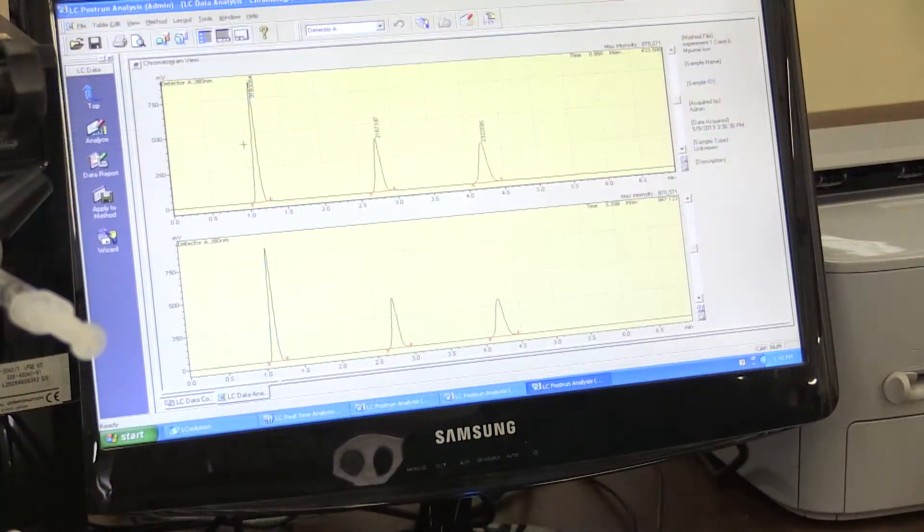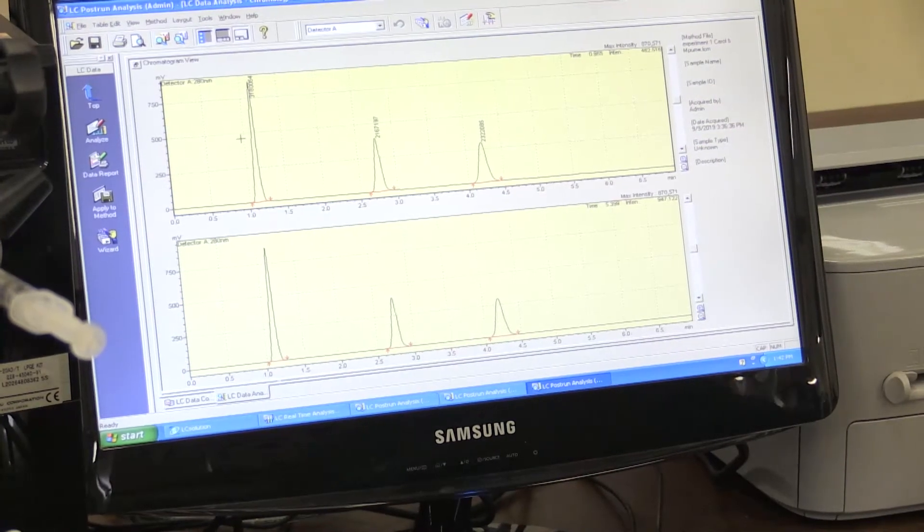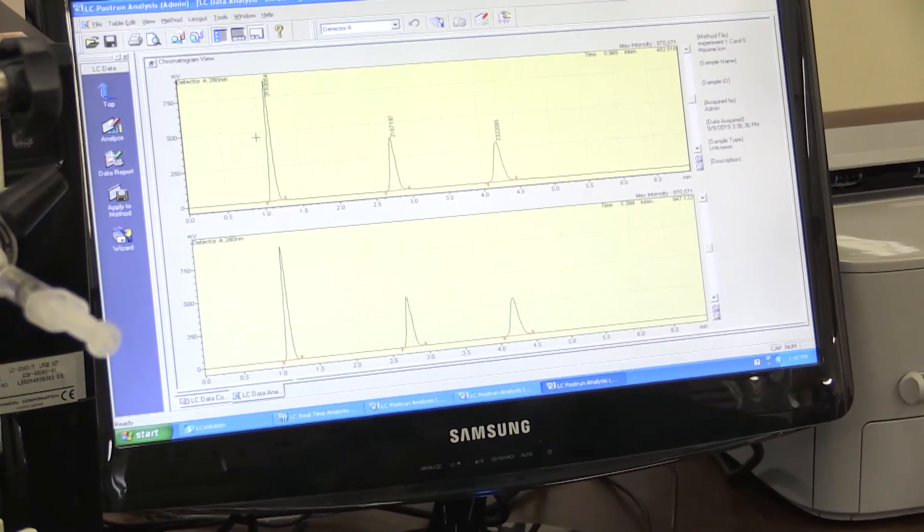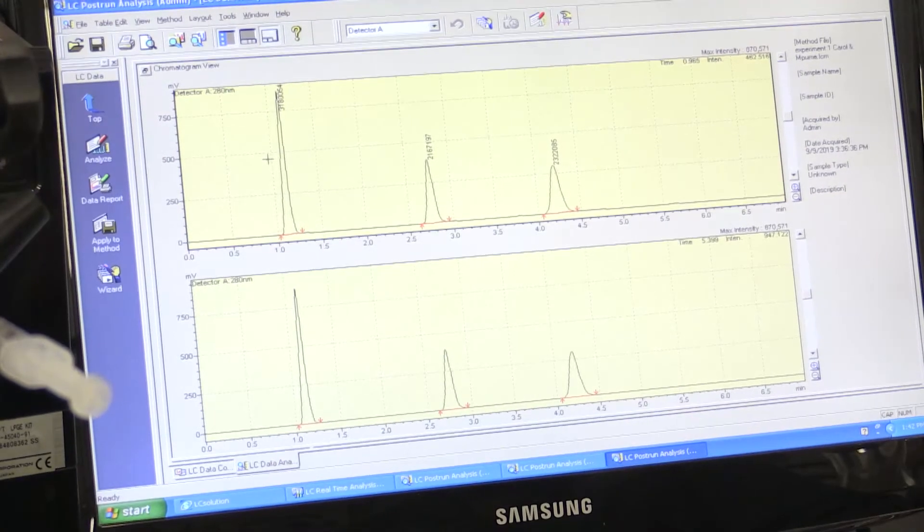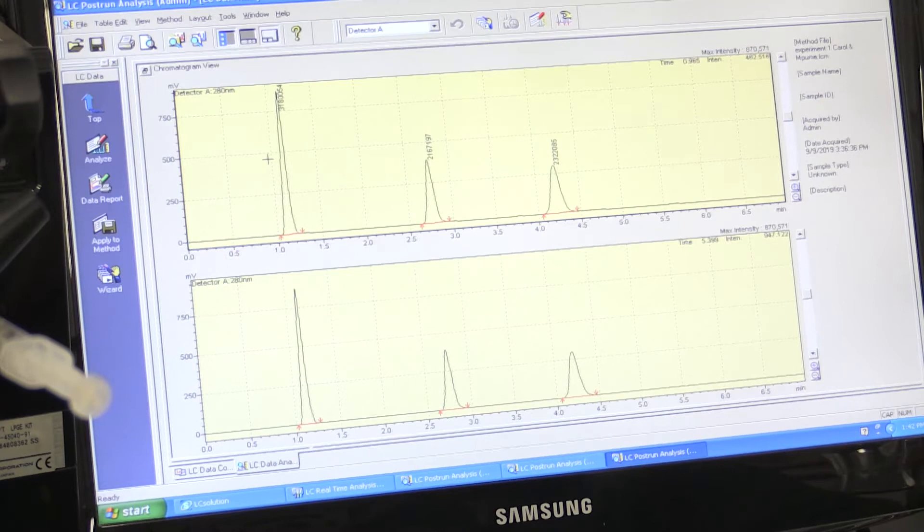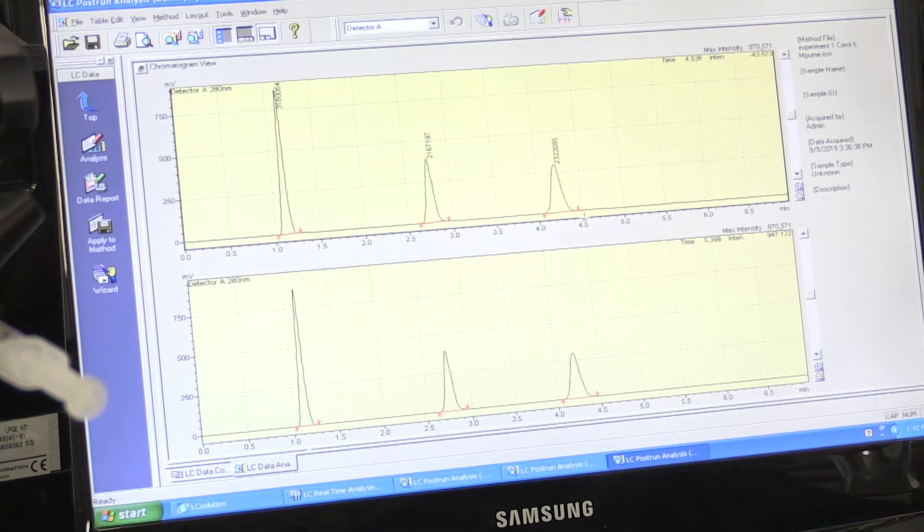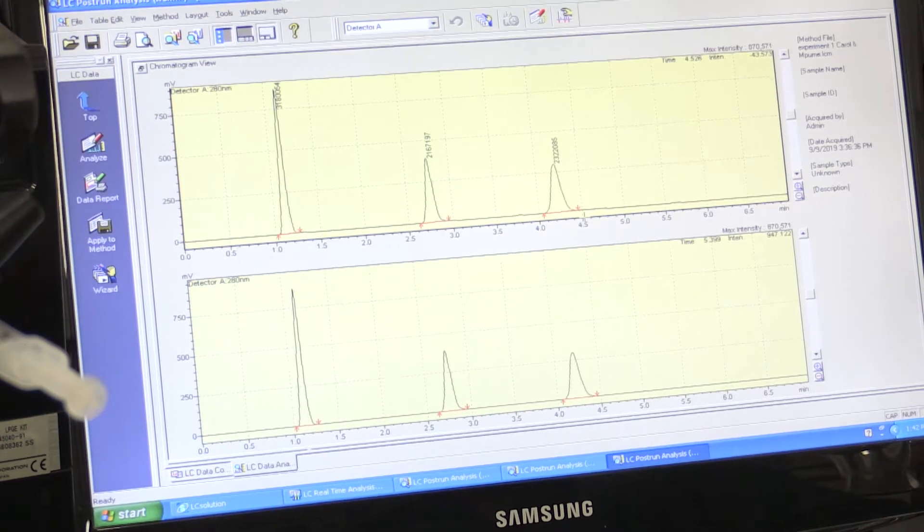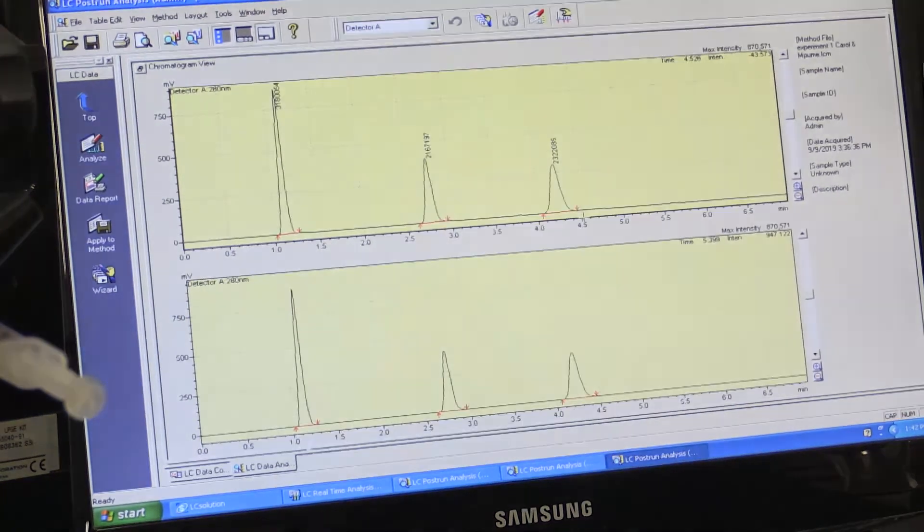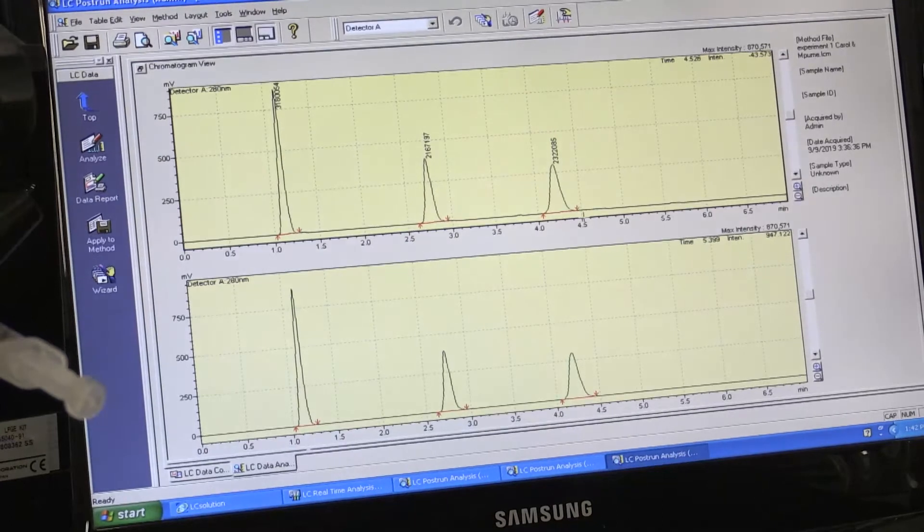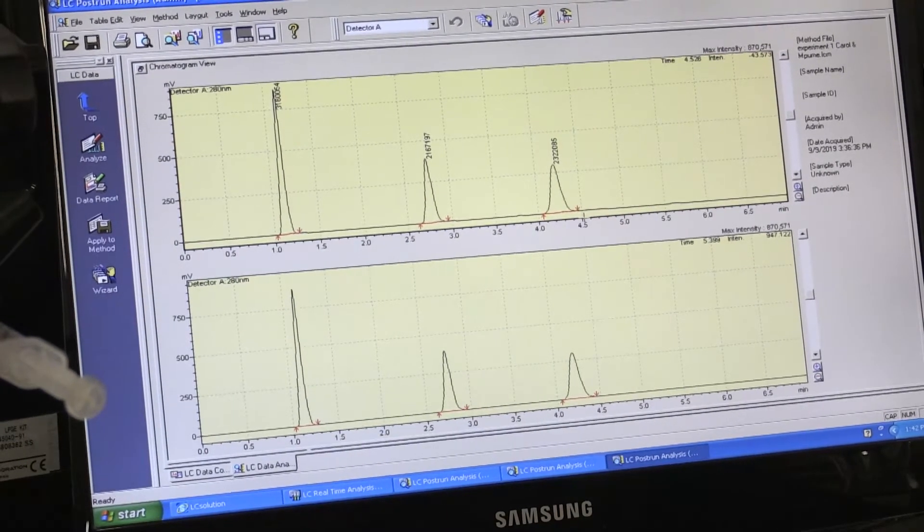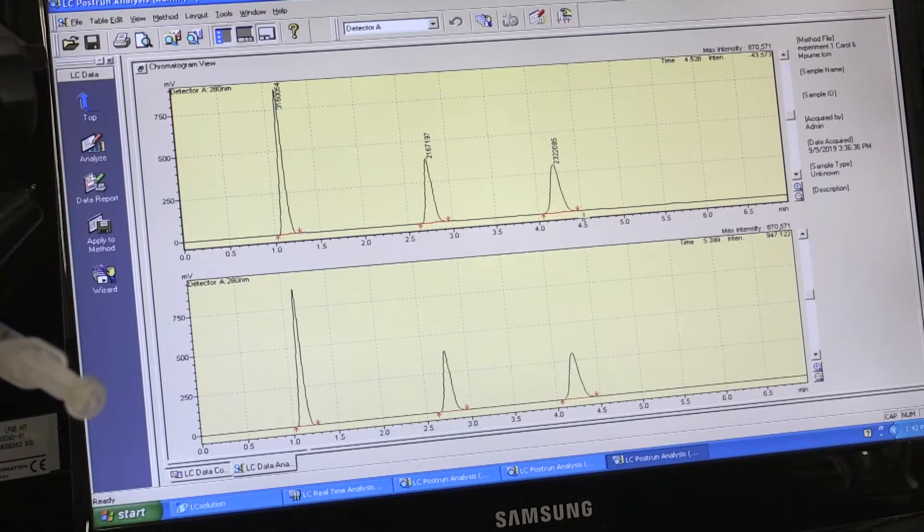This is the chromatogram for the analysis at 280 nanometers. As you can see, this chromatogram only has three peaks, which indicates that one of your compounds does not absorb very well at 280 nanometers compared to 254 nanometers.